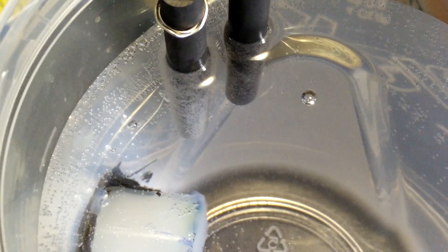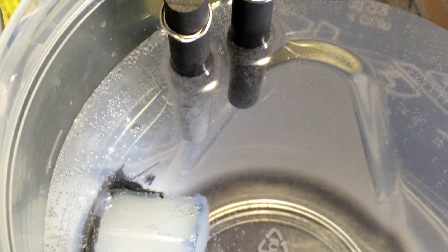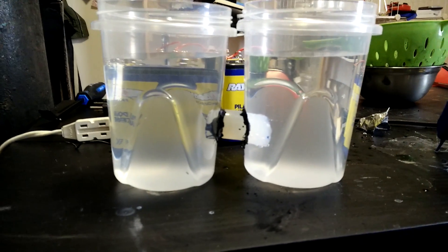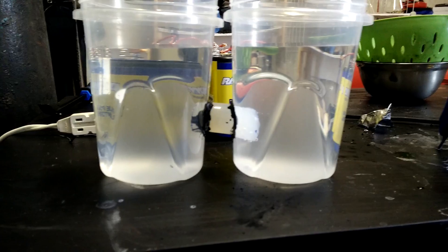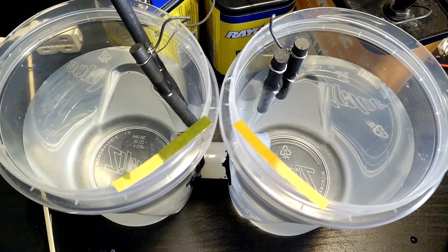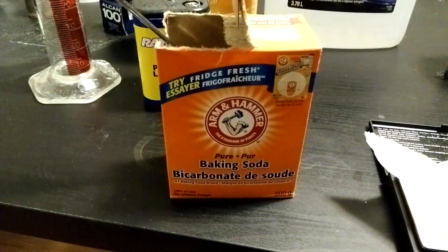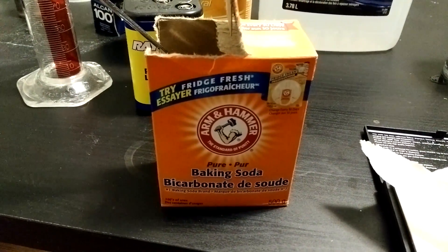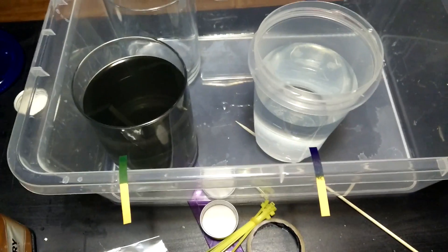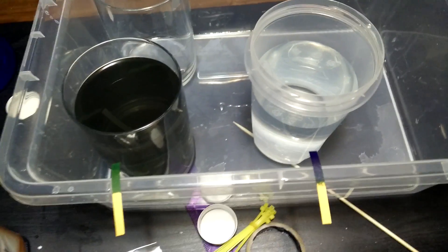Electrolysis is a chemical process that works by putting electricity through a solution to form a compound of interest. A membrane cell is a form of electrolysis where the liquid is separated into two separate containers joined together with a membrane. They are useful for a variety of things and are the basis for many fuel cells. In this video I'll be using one to convert regular baking soda into highly corrosive sodium hydroxide. They can be made from almost anything and are ideal for home experimentation.